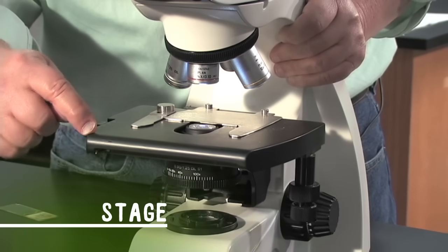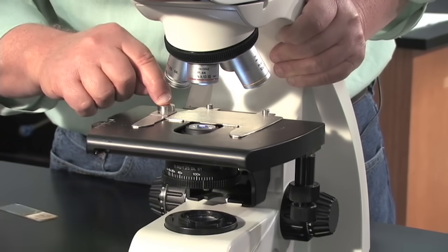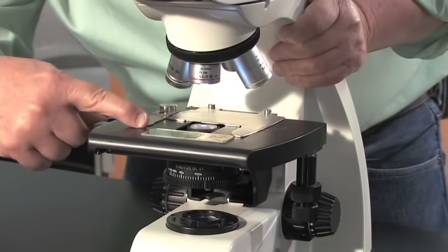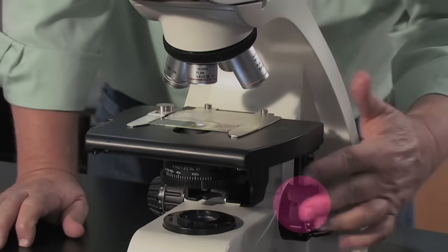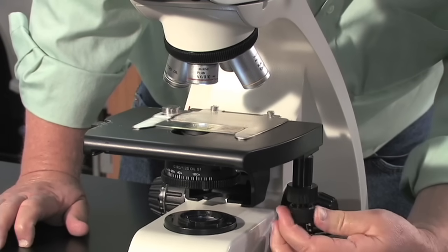This part of the microscope is called the stage, and on it is a mechanical stage. This is what's going to hold the slide and let us move it around. To put a slide on the microscope, we simply pull the arm back, slide the slide into the angle, and let go of the arm. We move the slide around by using these two knobs — this knob moves the slide up and down, and this knob moves the slide left and right.